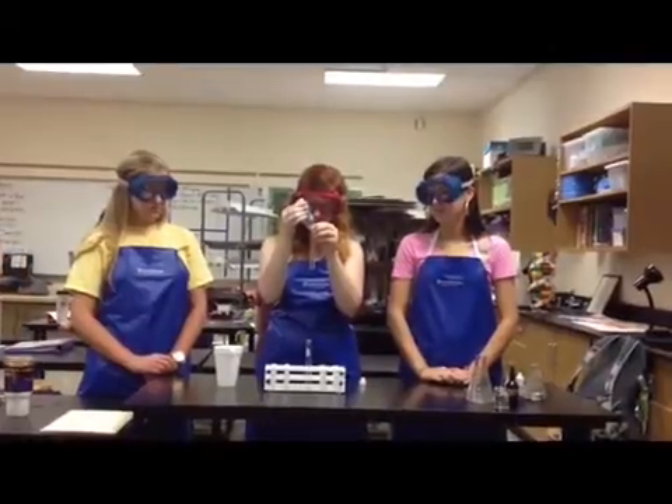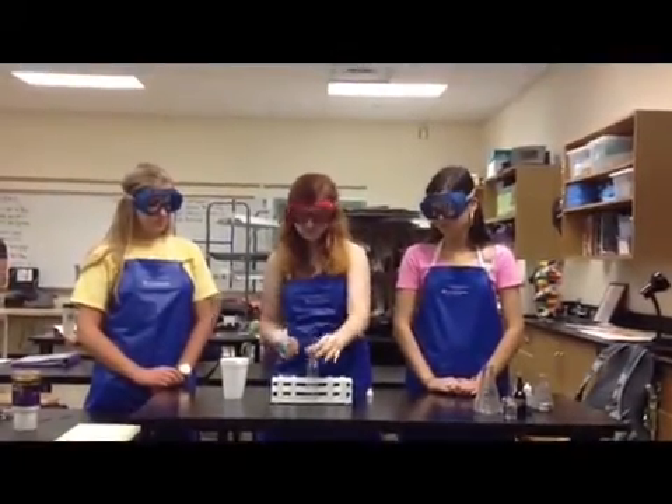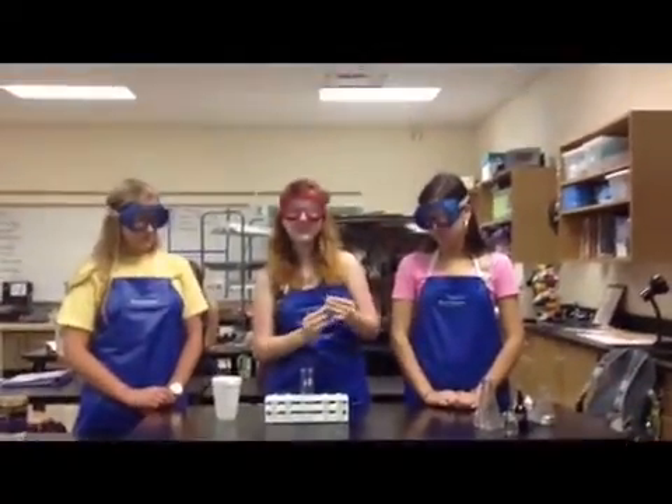This is water mixed with sugar — fifty percent water, fifty percent sugar. We're going to put ten drops of Benedict's in the sugar water. Now we're going to place each test tube, both at the same time, to soak in hot water for two minutes.